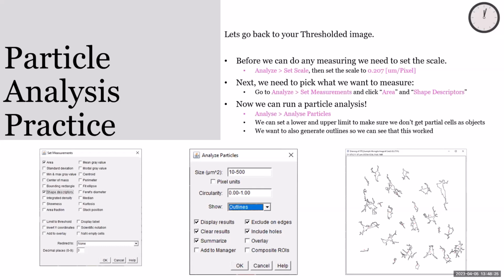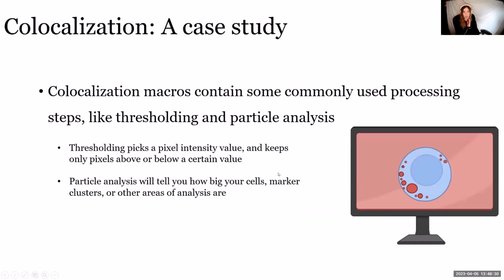Okay, I think, all right, in the interest of time, we should try the colocalization one and I can go from there.